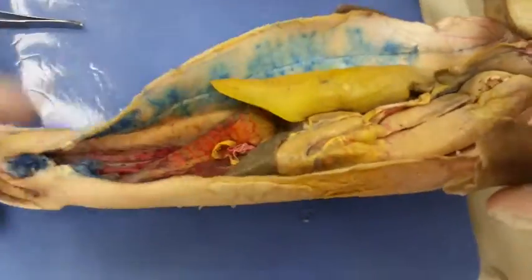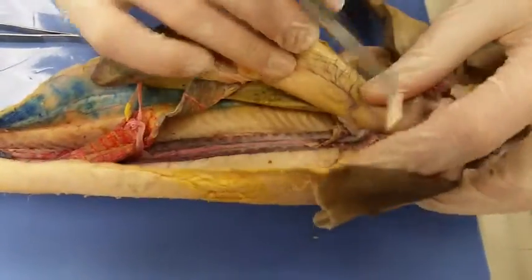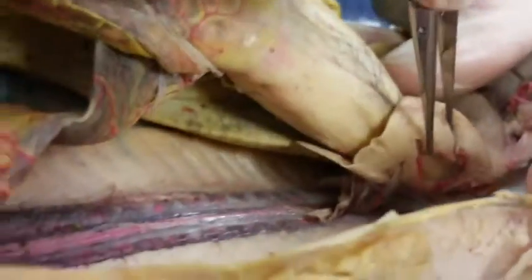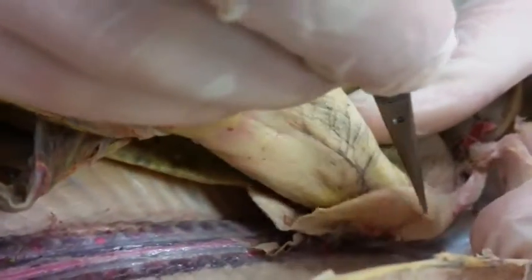So, getting back to our shark. Our shark is female. We have a large ovary right there. We have very nicely sliced it open accidentally, so ovary.